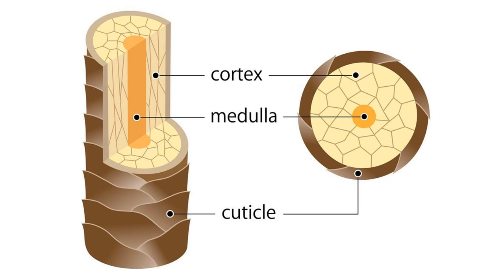This is the cortex. The middle portion seen in yellow is the medulla. The outermost portion with the imbricate or scale-like patterns is the cuticle. On the right side we can see the cross-section area. This is how the hair looks under a microscope.